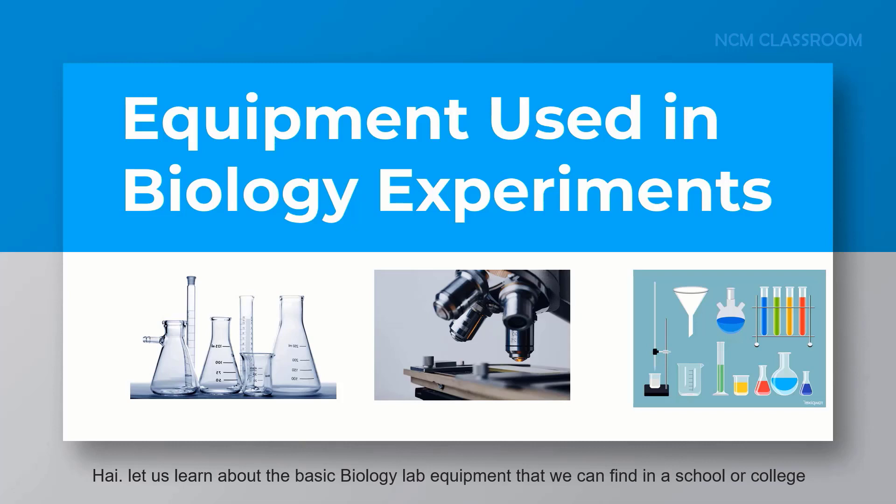Hi, let us learn about the basic biology lab equipment that we can find in your school or college.